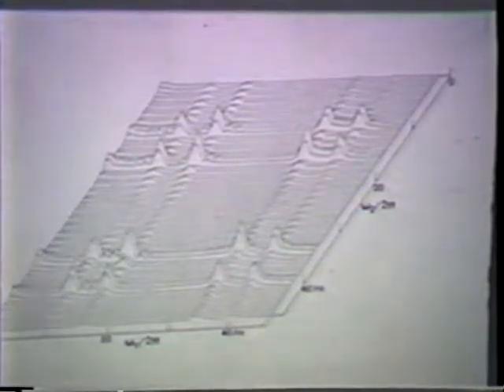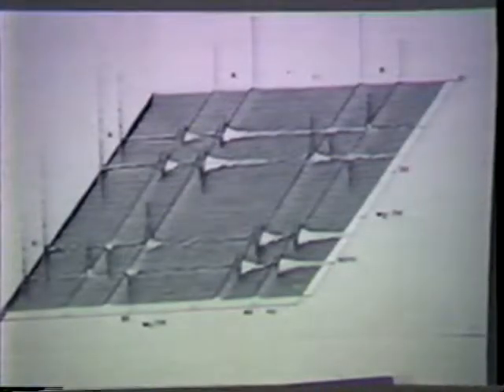The next slide shows the experimental spectrum, but it is an absolute mode spectrum. We see that these are the diagonal peak multiplets, and these are the cross peak multiplets. You might notice, particularly in the next one maybe, that this is the phase sensitive spectrum, an experimental spectrum, and its similarity with the calculated spectrum is quite remarkable.